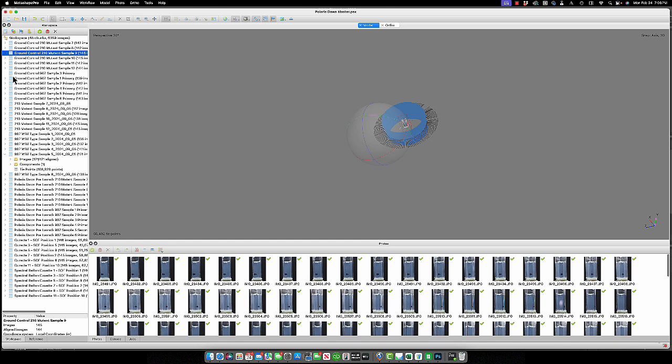So you can see there's still 4 I have issues with. There's this one where you don't see an arrow. There's this one where you don't see an arrow. This one, and this one where I actually just experimented a little bit. So there is data here, and I'll explain why in a second. But let's say I needed to rerun these 4, and for the sake of argument, say that the images are still in here.